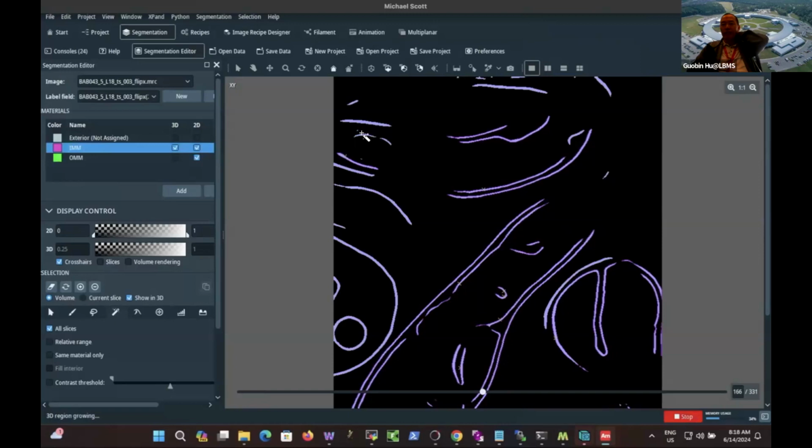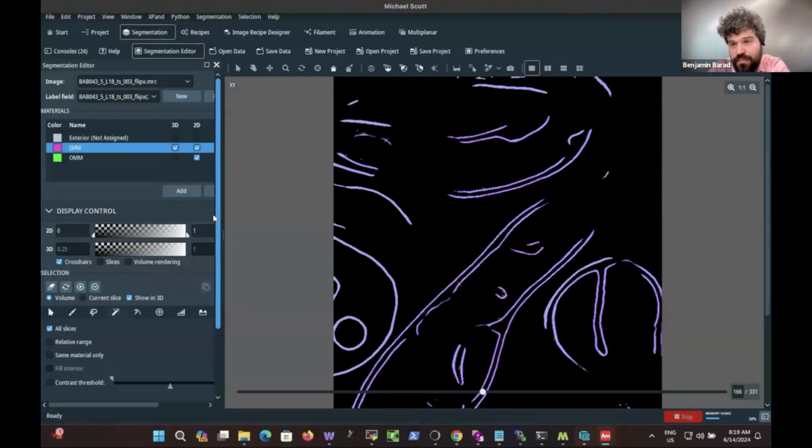Okay, you mentioned the data acquisition. So what software are you using? How do you speed it up? So 2 years ago, there was a paper called PACEtomo from Fabian Eisenstein in Rado Danev's lab. What they did was all of this amazing math that let them do beam shift, image shift with tilting. So they predict when you tilt a sample where the stuff is going to move so they can beam shift, image shift to the new position. And it allows you to take many images per tilt series now. It means that we typically spend about 4 minutes on each tilt series instead of the 30 we used to spend.